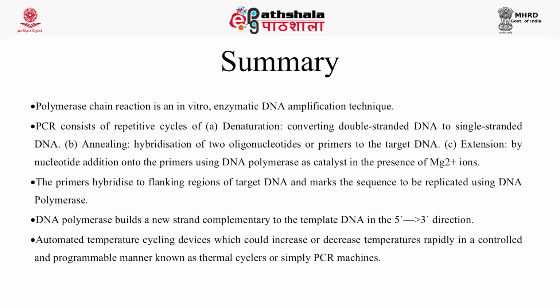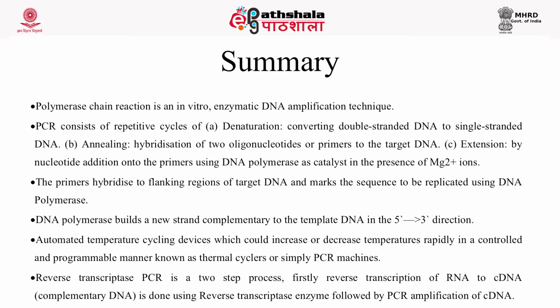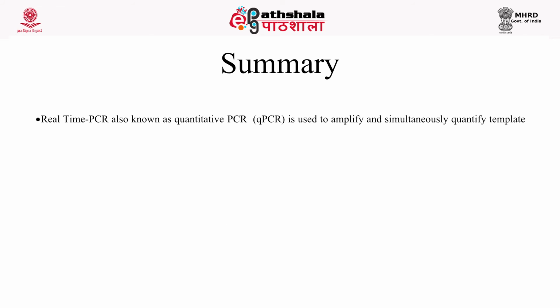We have also learned about reverse transcription PCR. This reverse transcription PCR, also known as RT-PCR, converts RNA into a complementary DNA strand using reverse transcriptase enzyme. This complementary DNA, also known as cDNA, can be further amplified using the PCR technology. A great advancement over the conventional PCR is the real-time PCR. The real-time PCR can quantify and amplify the DNA fragments simultaneously. The real-time PCR technology uses hydrolysis probes or DNA double-stranded binding dyes such as SYBR Green dyes to quantitate the DNA formed after each cycle of the PCR reaction.